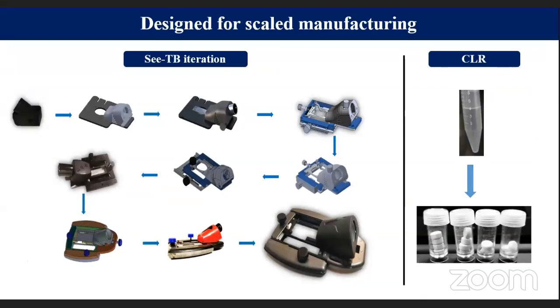This is the iteration where we started building our device. We moved systematically from one to another based on the feedback we were getting, or ease of usage, and made it more universal to all the microscopes possible and easy to attach. Now, this device is the final device.